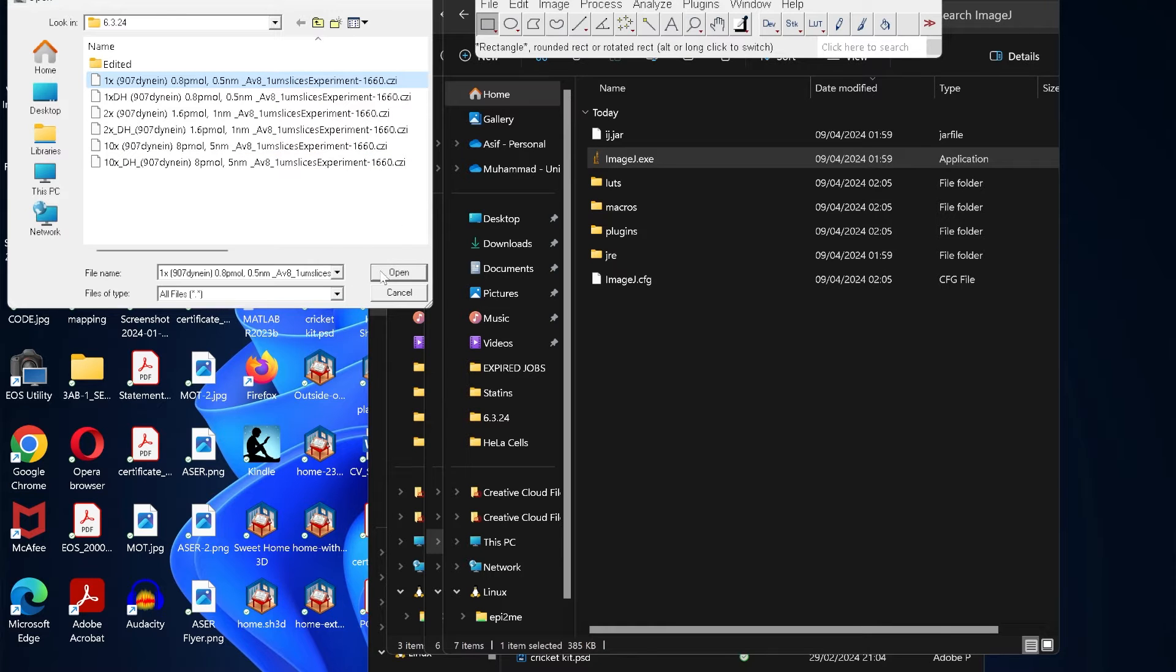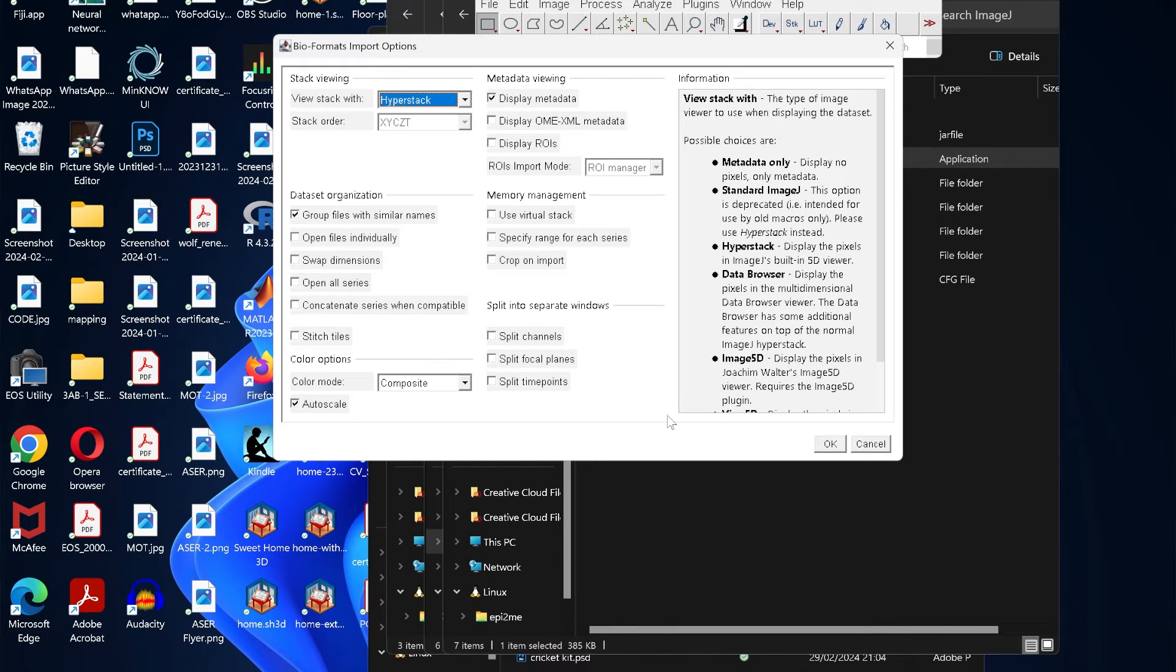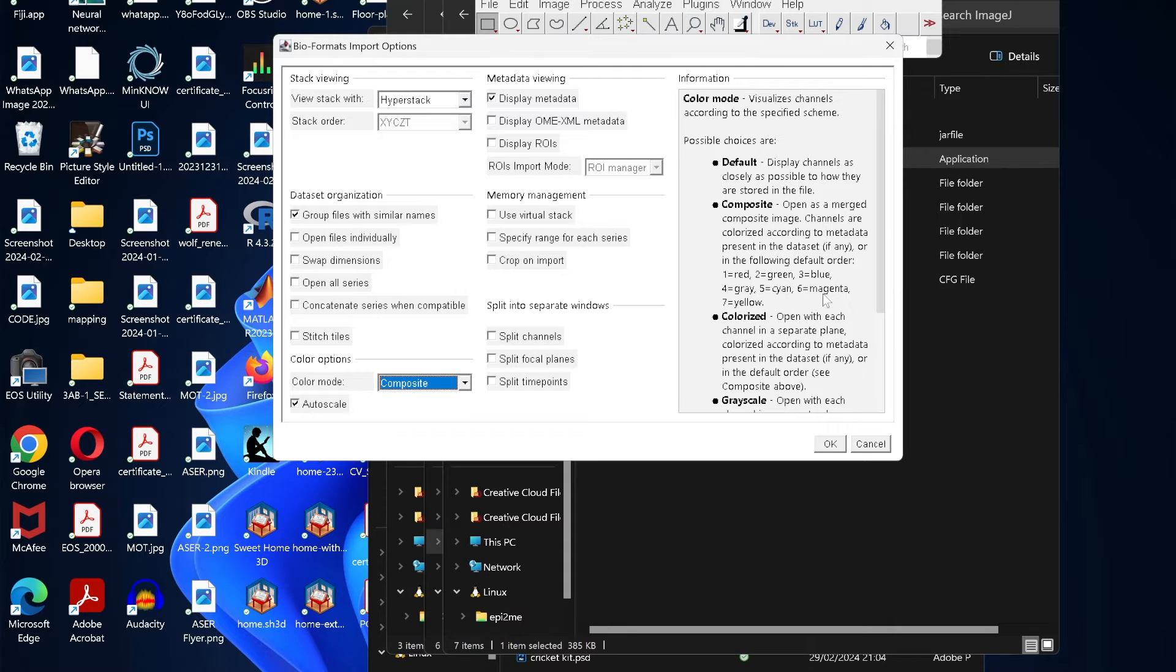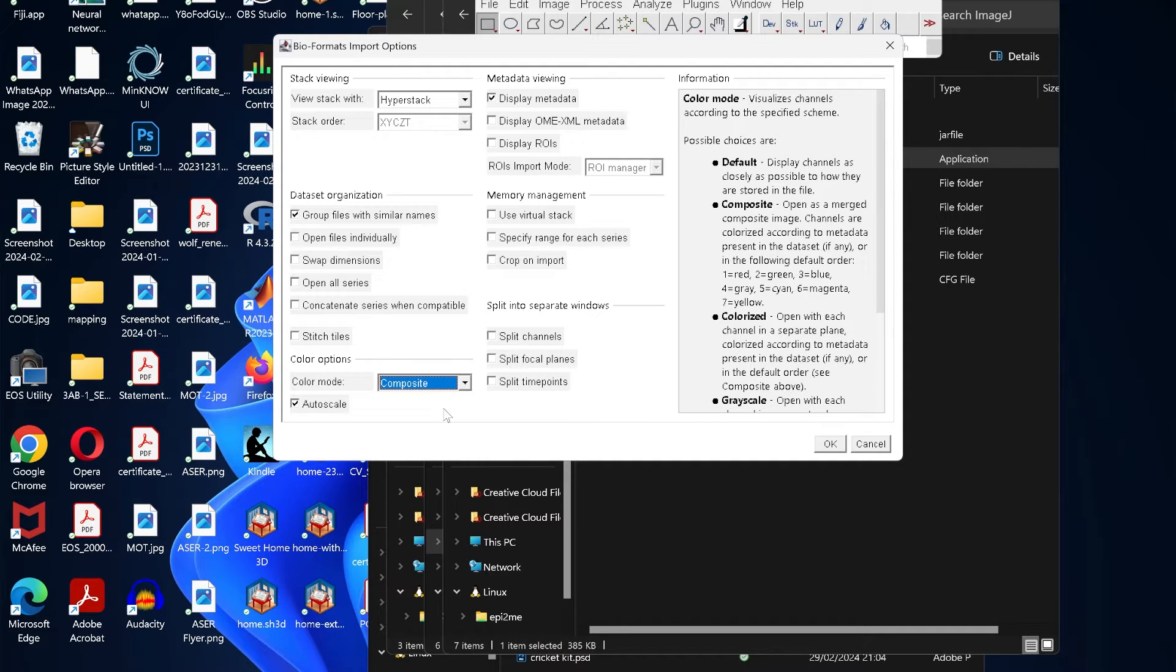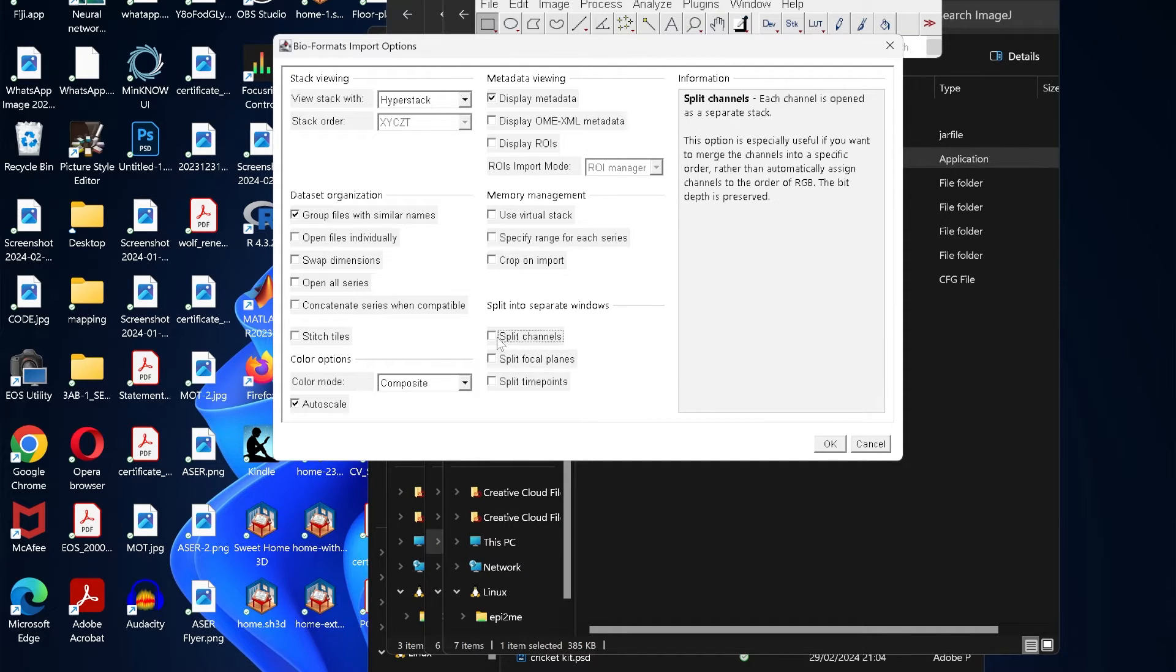That will open this window. Leave all the options as they are except this color mode. Here we have different options, so we leave it on Composite and make sure that Split Channel is unselected.